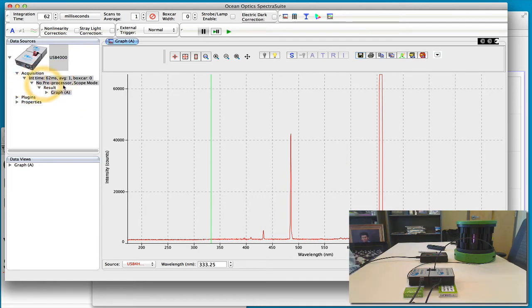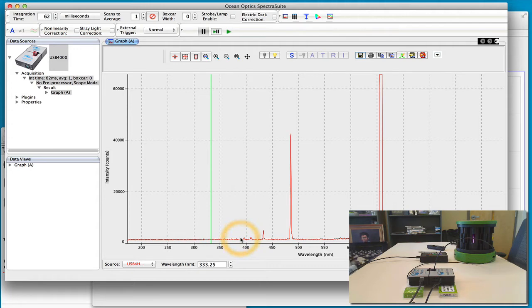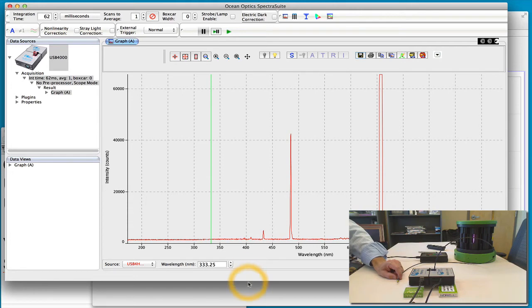And so again, this is using a USB 4000, we can change the integration time, collect longer, get more of the higher energy emission line peaks. You can also do this in a different spectrometer like the Vernier.